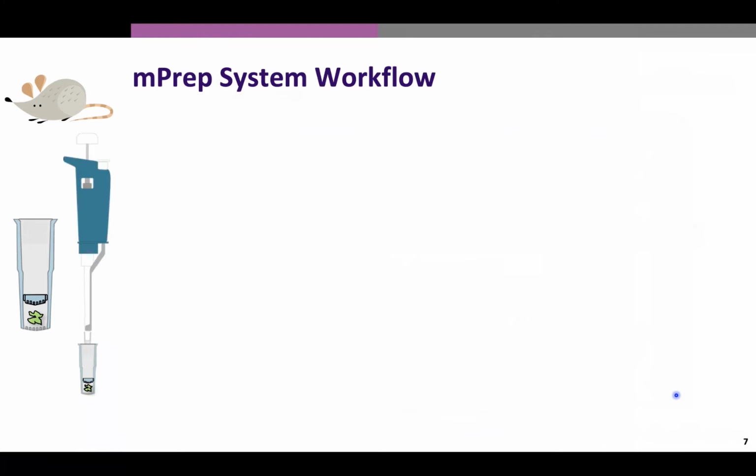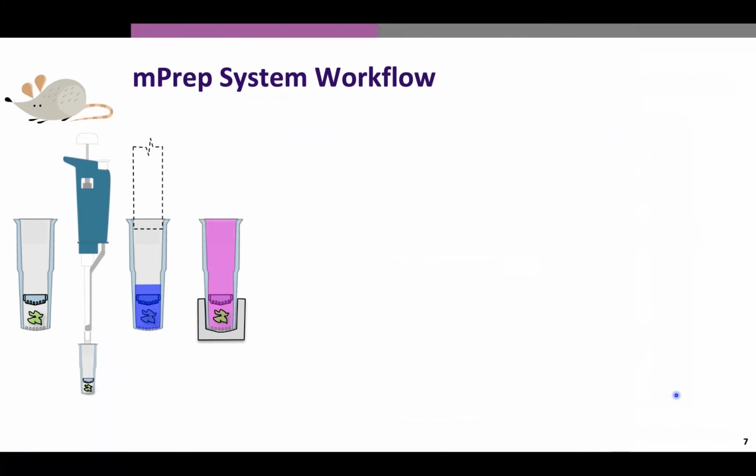The capsule is attached to an ordinary pipetter, a pipetteman, and the pipetteman delivers all of the chemical reagents to the specimen from possibly the initial fixation, certainly through dehydration, post-fixation, and resin embedding. Once the specimen is fully embedded in a resin, it is transferred to the oven for curing.